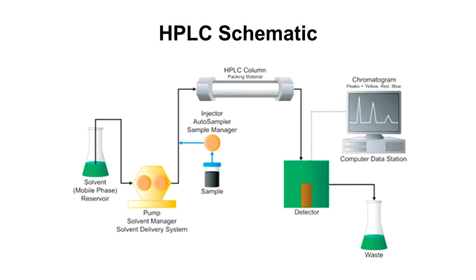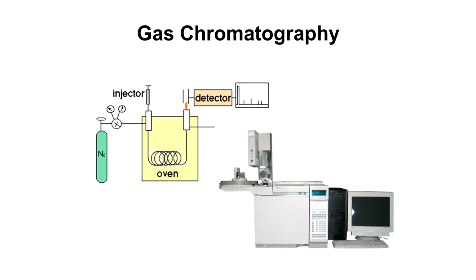And through that, you generate a chromatogram with peaks basically corresponding to one or more compounds. So HPLC is central to MS. So when we say LCMS, it's really HPLCMS or UPLCMS. And in that regard, mass spec still requires basically working with relatively pure components of a mixture.